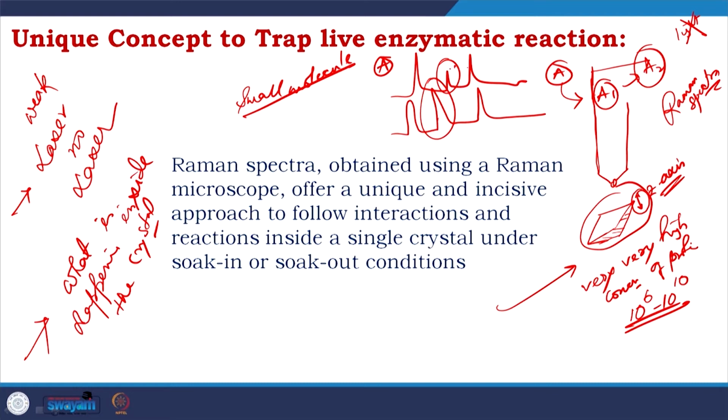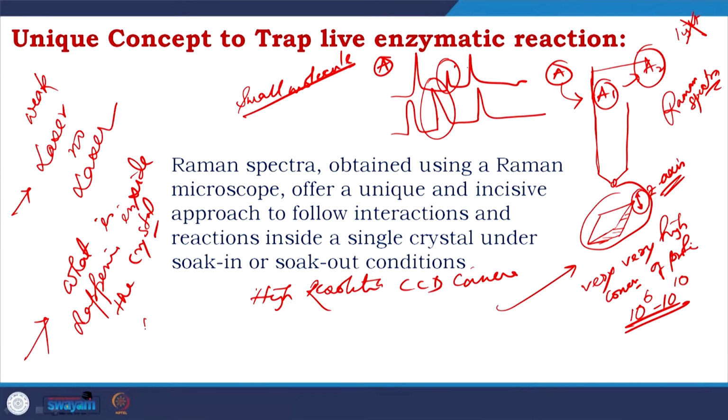So, what you do, you have a high resolution CCD camera. So, the ray is coming out, you get the thing live.